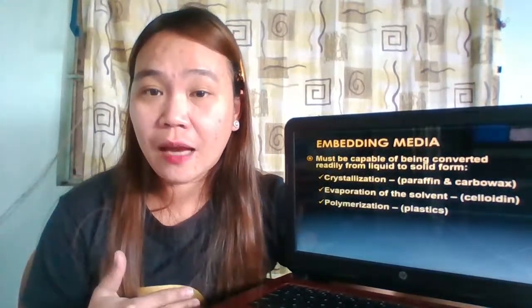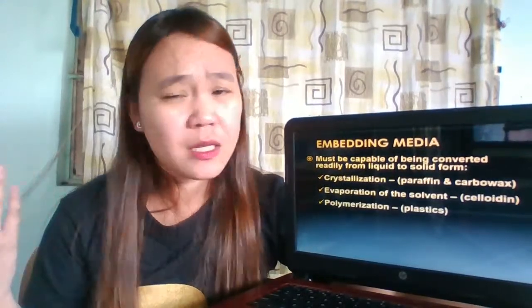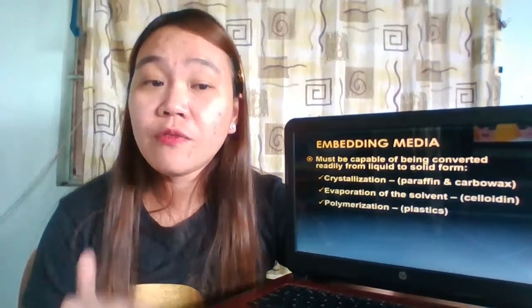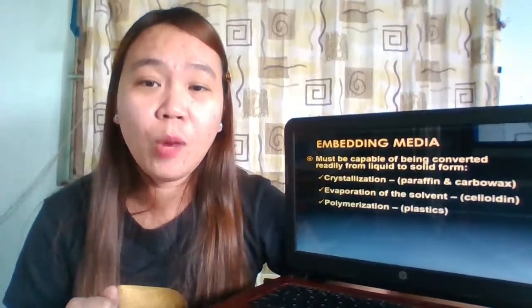So now we understand why we need the liquid form. Now, what is the importance of the solid form of your embedding media? The solid form is important during the embedding process. Remember, what's the other name of embedding again?